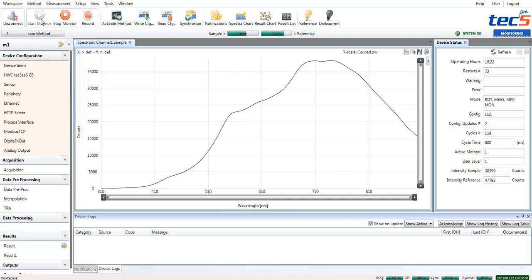Please remember again that this MPT software only shows you what is acquired and processed in the embedded system. Everything you see, transmission spectra, raw spectra, reference and so on, is transferred from the system and shown here in the sense of monitoring.